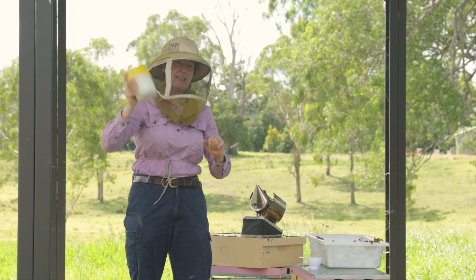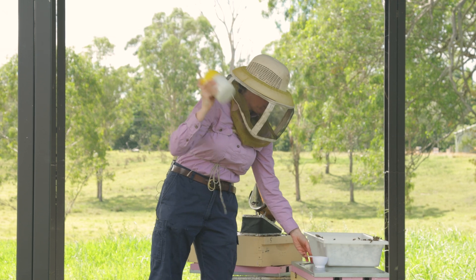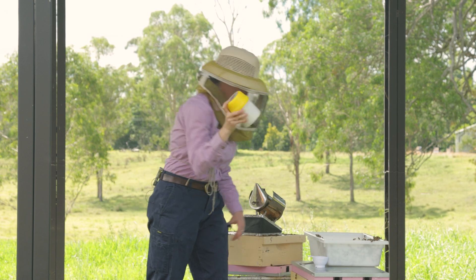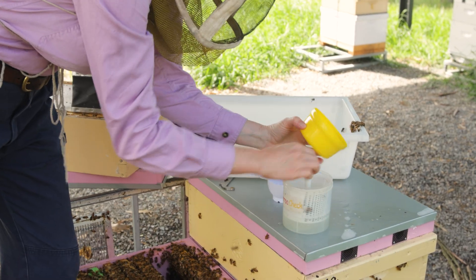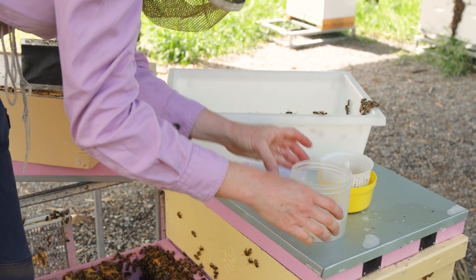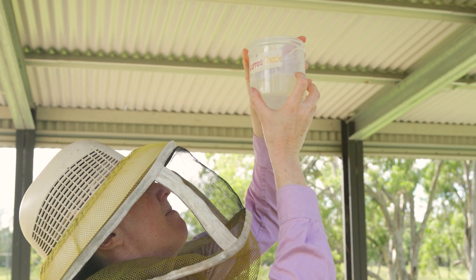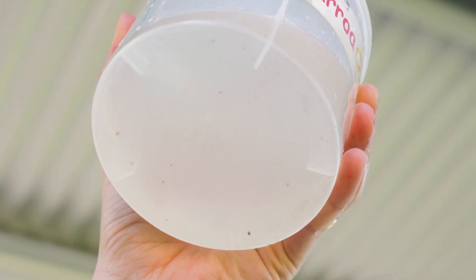We'll shake it for the second time for another 15 seconds. We'll take the bee sample out to have a look — still two varroa mites there. Now we move on to our third and final shake for 15 seconds.